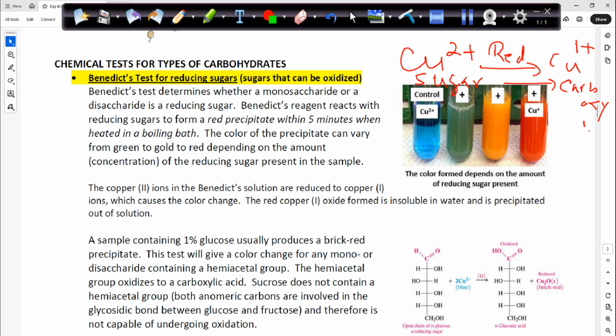Carboxylic acid. Here it is. This is the reaction here. That's a glucose, and you add to this Benedict's solution, which is a copper solution. Then what will happen here, this aldehyde will be oxidized to carboxylic acid, correct? And that's the whole thing.